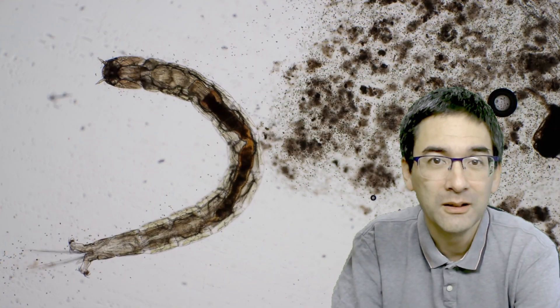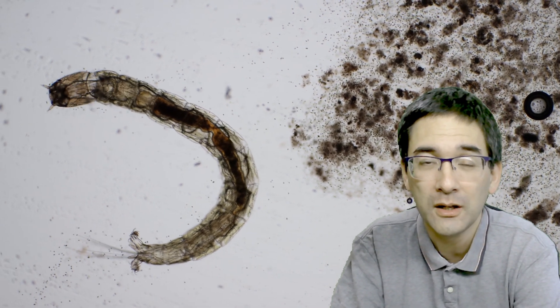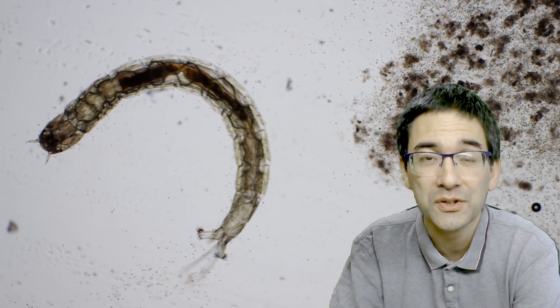It didn't take very long. This is what I found: of course many algae, a few rotifers as well, but most interestingly was this larva here.